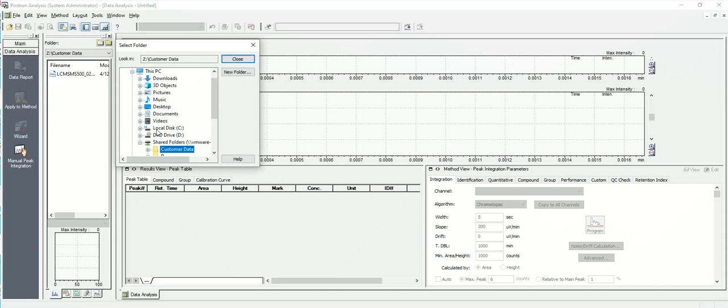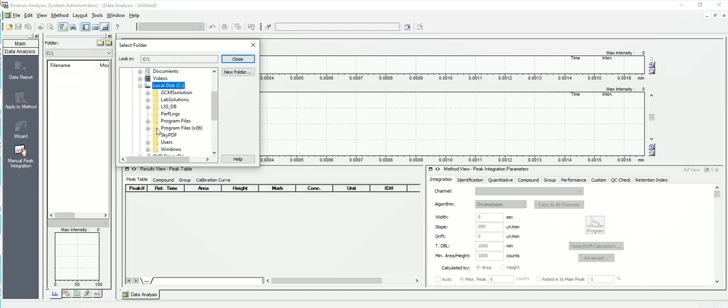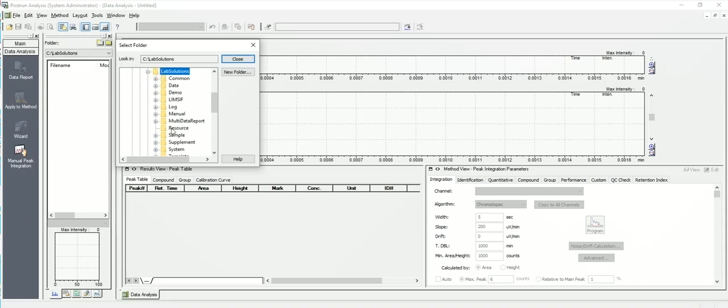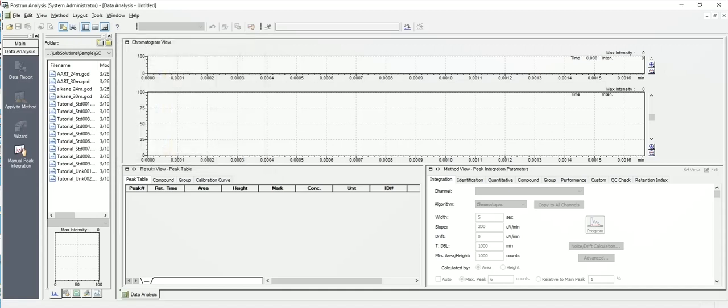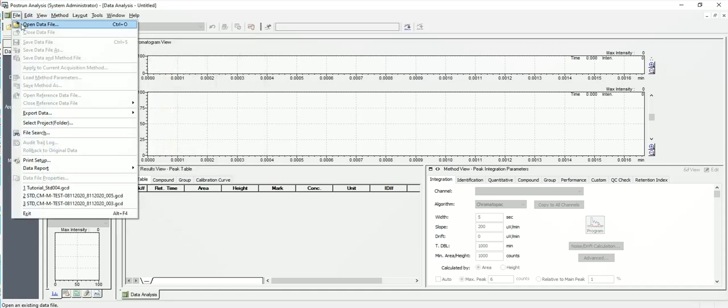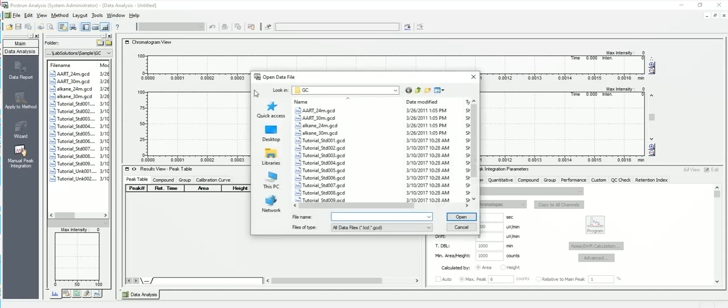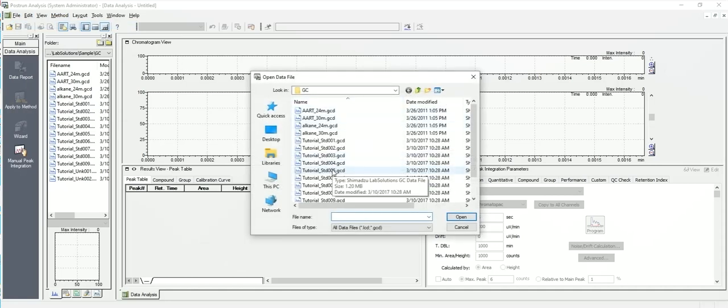But in this instance since I'm running on a virtual machine we're going to go to the samples GC. So you want to make sure you get to the right directory. Now when I say file, open data file, it opens into that directory. So I'm going to open up one of the tutorial samples.